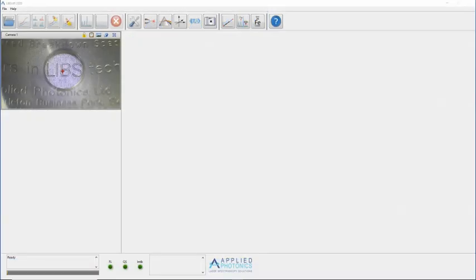The shortcut button to open the spectrometer configuration window, this one here, will be enabled if a spectrometer is connected to the system and has been successfully detected and initialized by libsoft. Selecting the shortcut button will display the configuration window on top of the main libsoft screen.